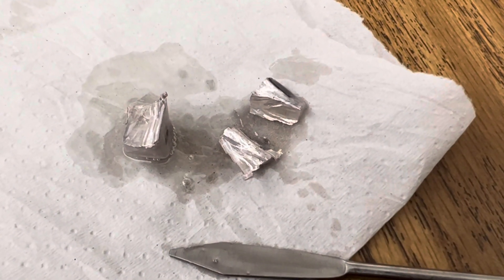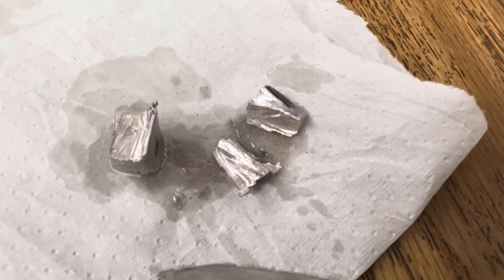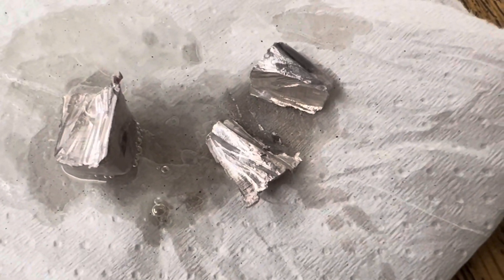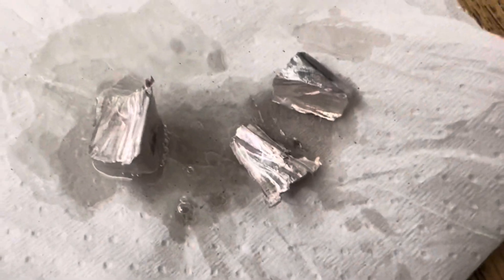I would certainly cut a very small piece of sodium for this experiment. You can see as I cut the sodium and that oxide layer is removed, how bright and shiny it is.